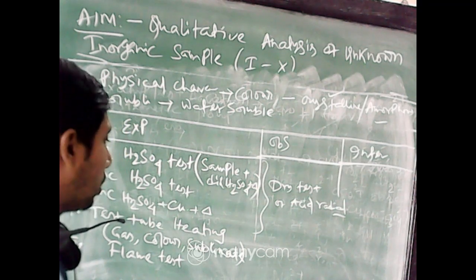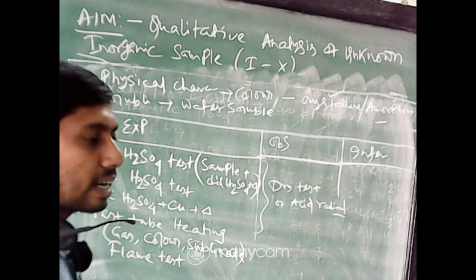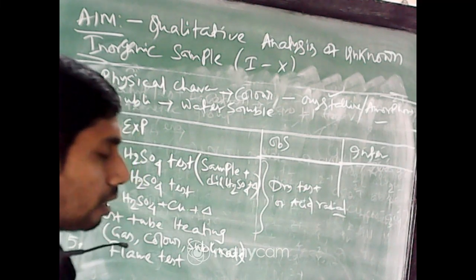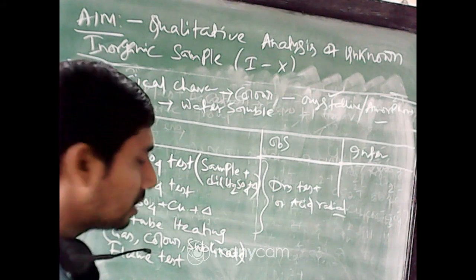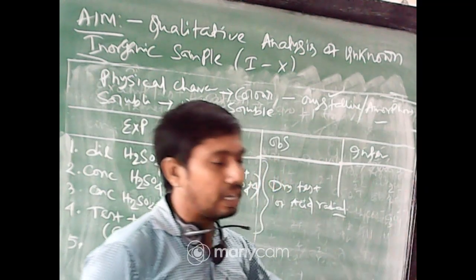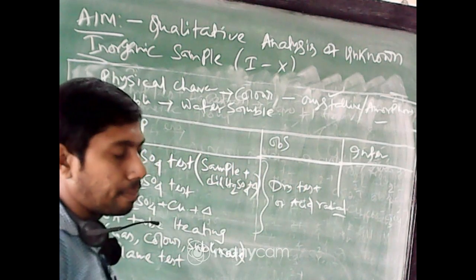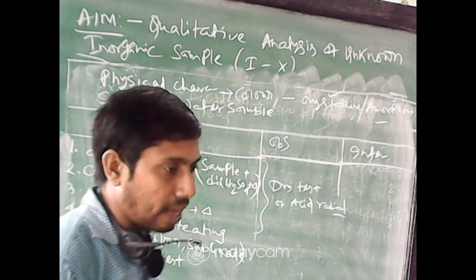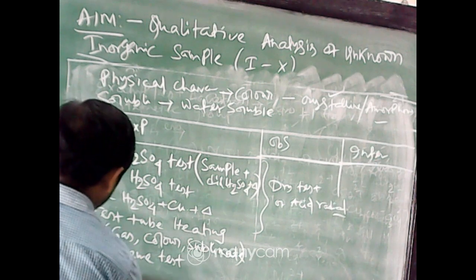That is, for example, strontium, barium and calcium, and copper. If these cations are present, then you have to write this flame test and present it, that a particular flame is formed, and it may be due to barium or strontium or calcium, etc. If these cations are absent, then no such flame is observed.